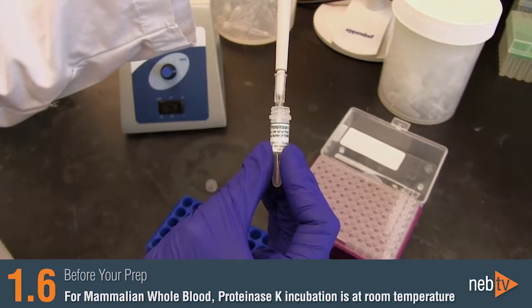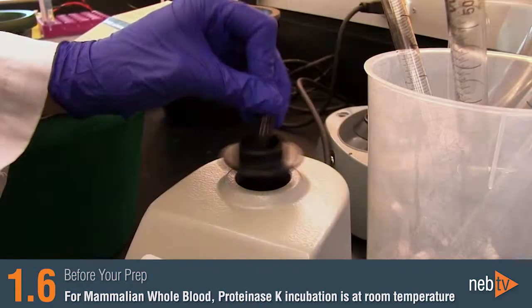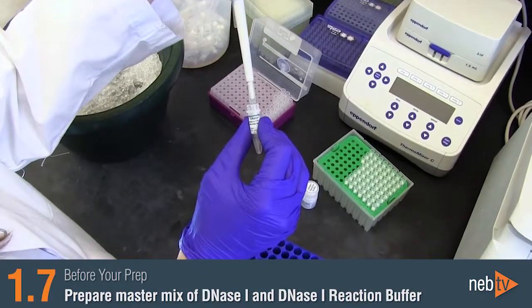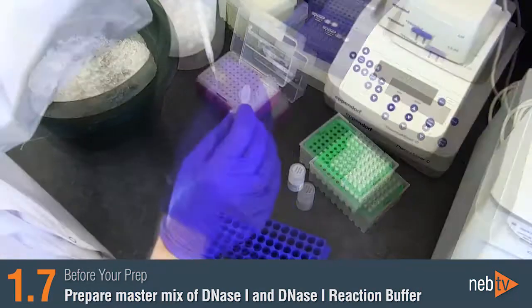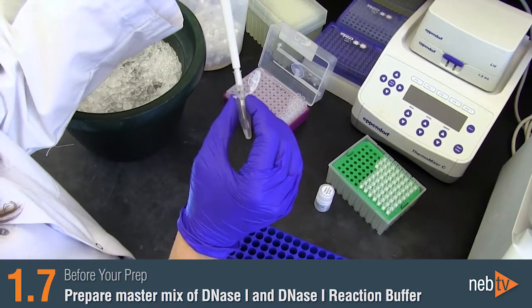Please be aware that when working with mammalian whole blood, the proteinase K incubation is carried out at room temperature. We also recommend preparing a master mix of DNase-1 and DNase-1 reaction buffer prior to beginning if you are performing multiple preps at once.